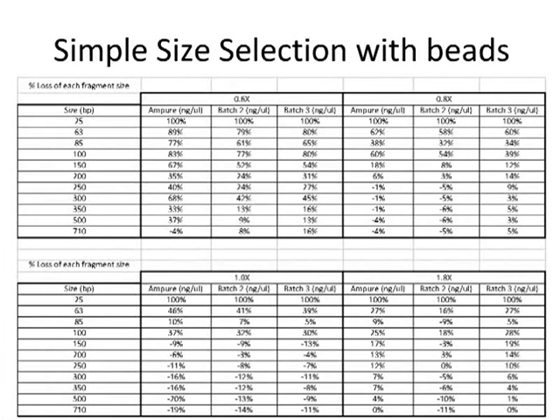And so these are different batches of Ampure beads, as you see here, with 0.6x at the top, 0.8x, 1.0x, and 1.8x, where 1.8x is the standard. Then there are the different fragment sizes, and the value is the percent loss in this particular case. So obviously any negative number just means no loss at all, because we're not making material. It just has to do with some error in the quantitation at the end.